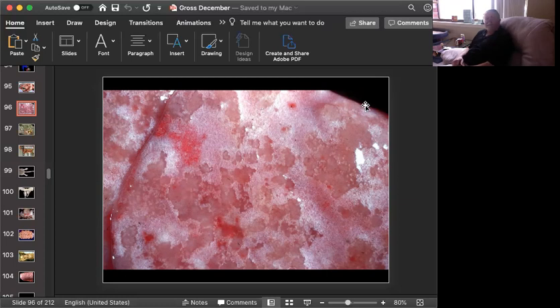There are a lot of cats out there that have subclinical infections, especially feral cats. And usually you don't get into trouble until you have some sort of superimposed infection, whether it is FIP, herpes viral infection or something. But you can find this in feral cats on a not uncommon basis in some parts of this country. Aelurostrongylus abstrusus, and this almost looks like frosting to me on top of these lungs. So Aelurostrongylus abstrusus, the cat lungworm.